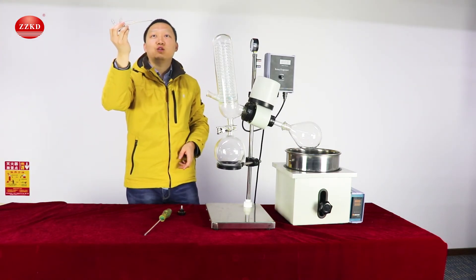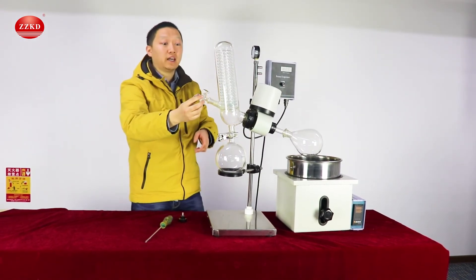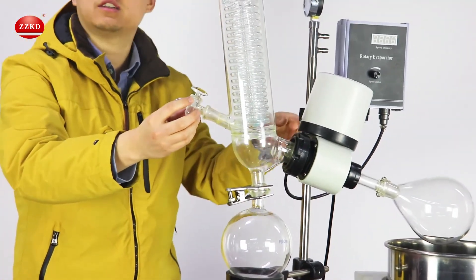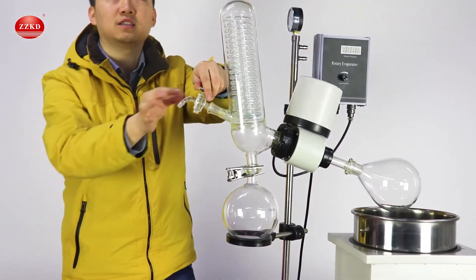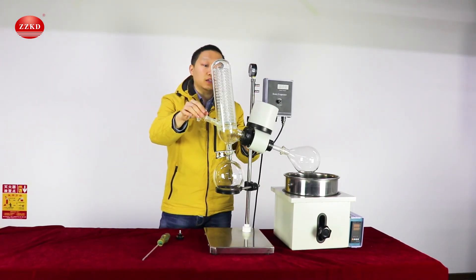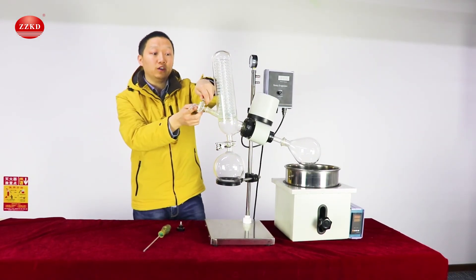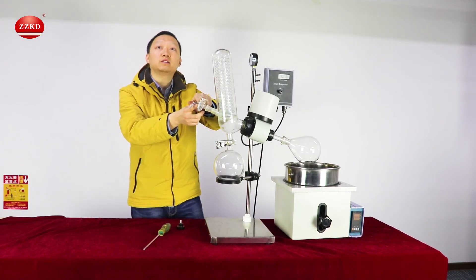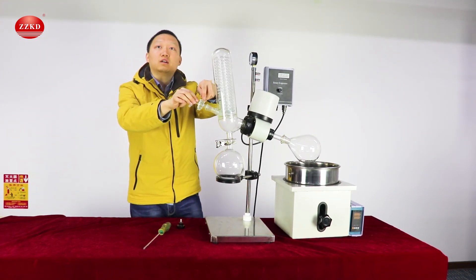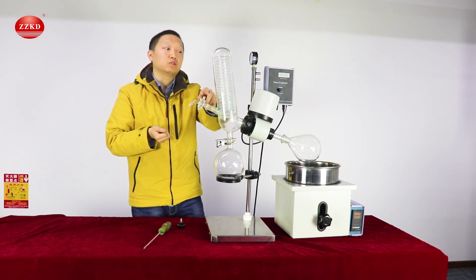I forgot this one — this one is also very important. This is the inlet valve. We can put it here. If you want to add more liquid material, connect one tube to this mouth and use the negative pressure inside the whole system — it will suck the liquid inside. One very important tip: after the experiment is finished, release the negative pressure inside the whole system using this valve first, then switch off the vacuum pump. Otherwise, if you switch off the vacuum pump first, the negative pressure will suck water from the vacuum pump into the system.